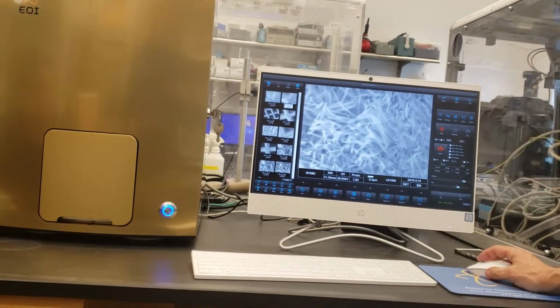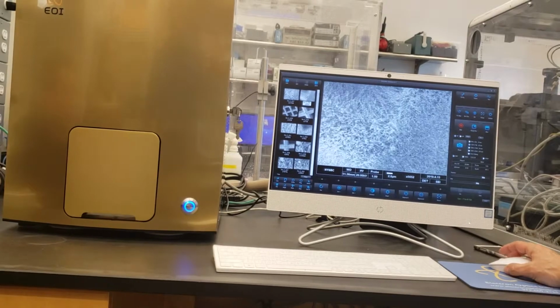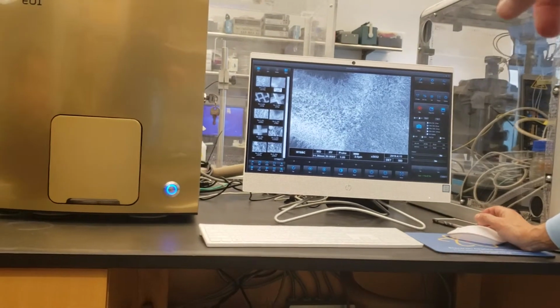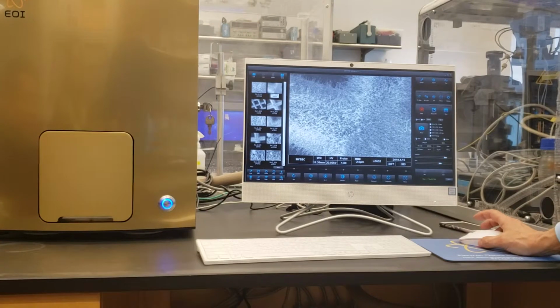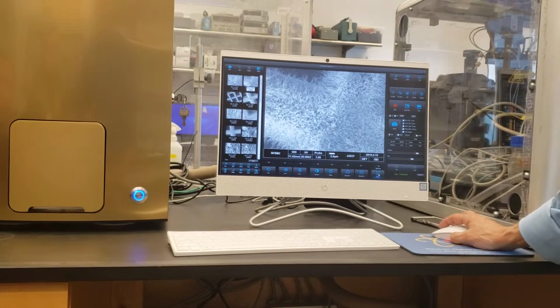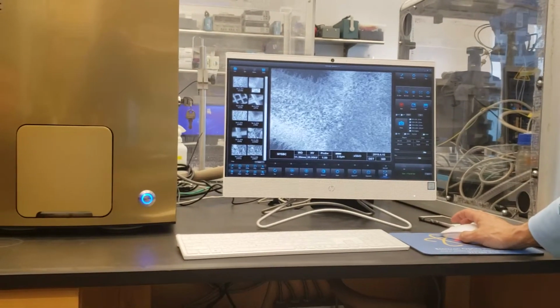Remember that wherever your mouse is located on the screen, if it's hovering over focus, your trackball will then become focus. So as I'm moving it around focus-wise, I'm changing the focus. When you're in this window with the mouse, then it becomes zoom.